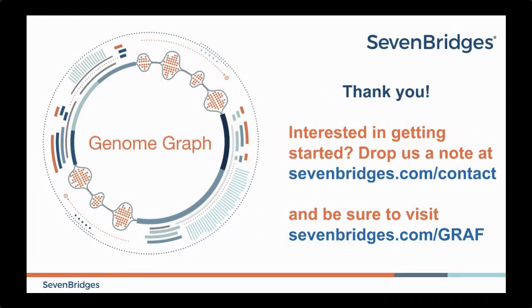Okay, so I've been reading the questions, and I think there are several very interesting questions here, and I will take them roughly in chronological order. The first question is from Frank Bellman. Does it make sense to deploy region-specific graphs for alignment and variant calling, for example, focused analysis of a disease locus?